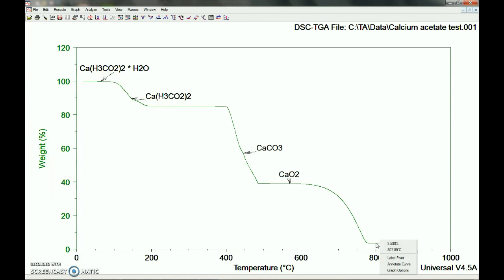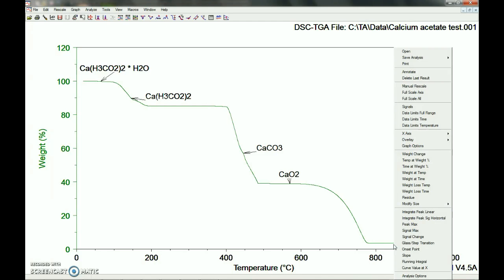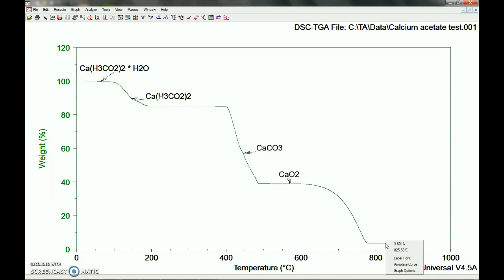Right here, it says it's 3.5%, but it's flatlining at that. So that's maybe a little bit of the calcium that's left, just kind of as a residue. But otherwise, that's kind of just like the weight of the pan. So that's basically zero right there. You can figure out all of the mass from that. That's really how you analyze a TGA graph that you get by calculating out percent mass loss from the molecular formula.